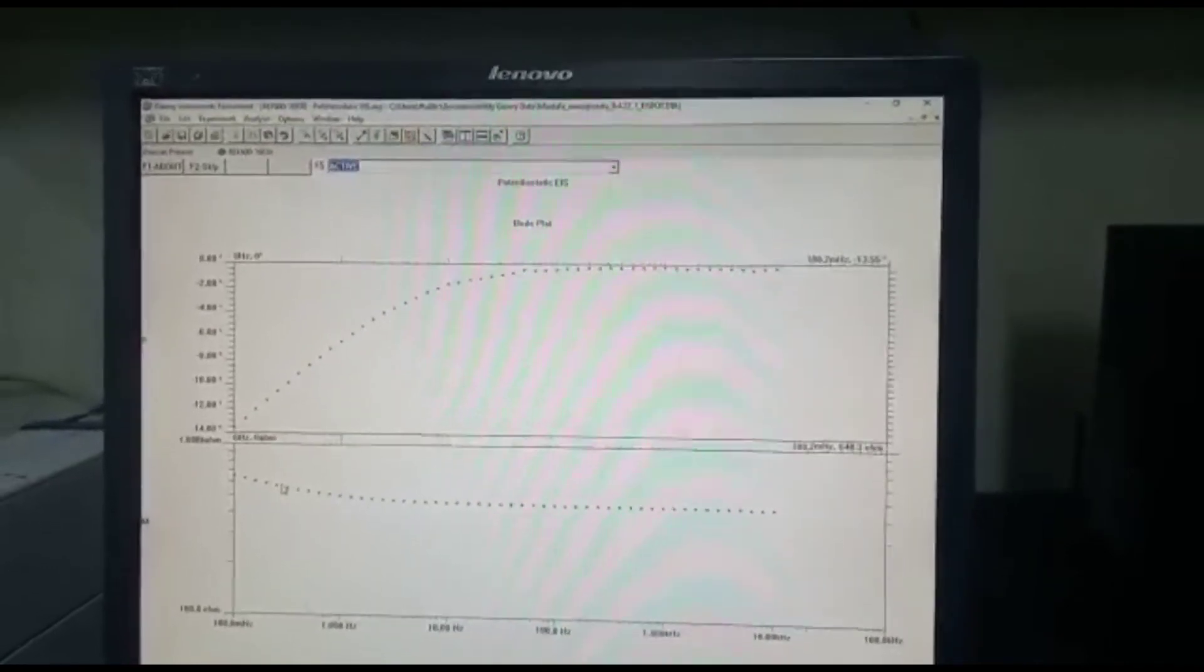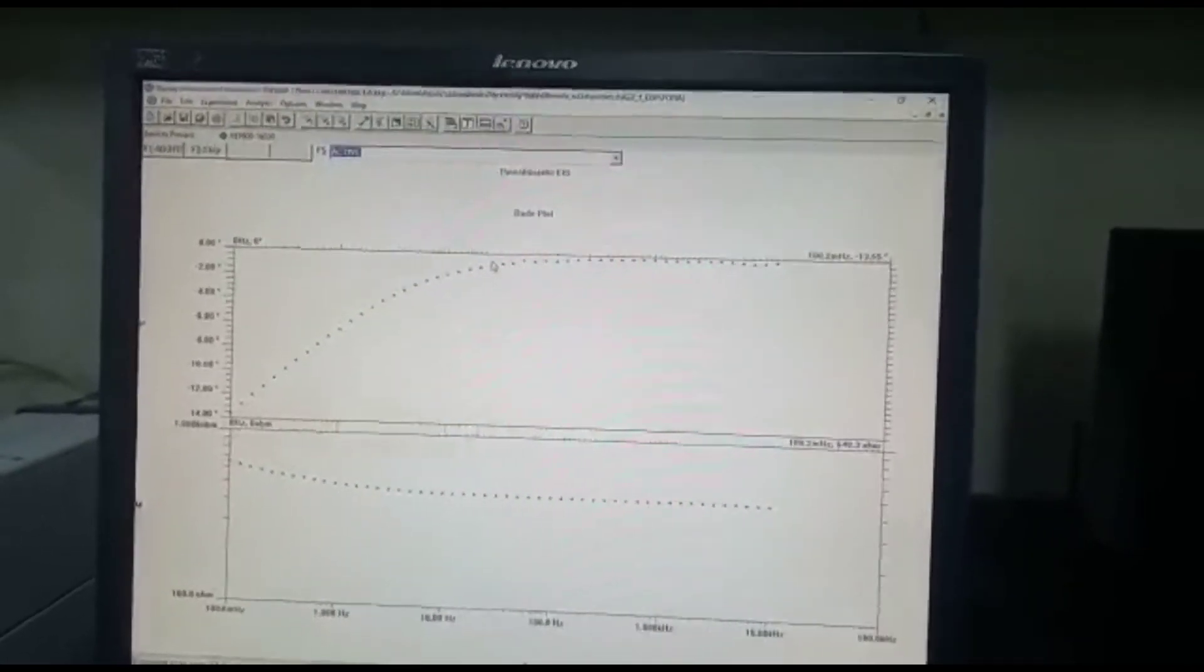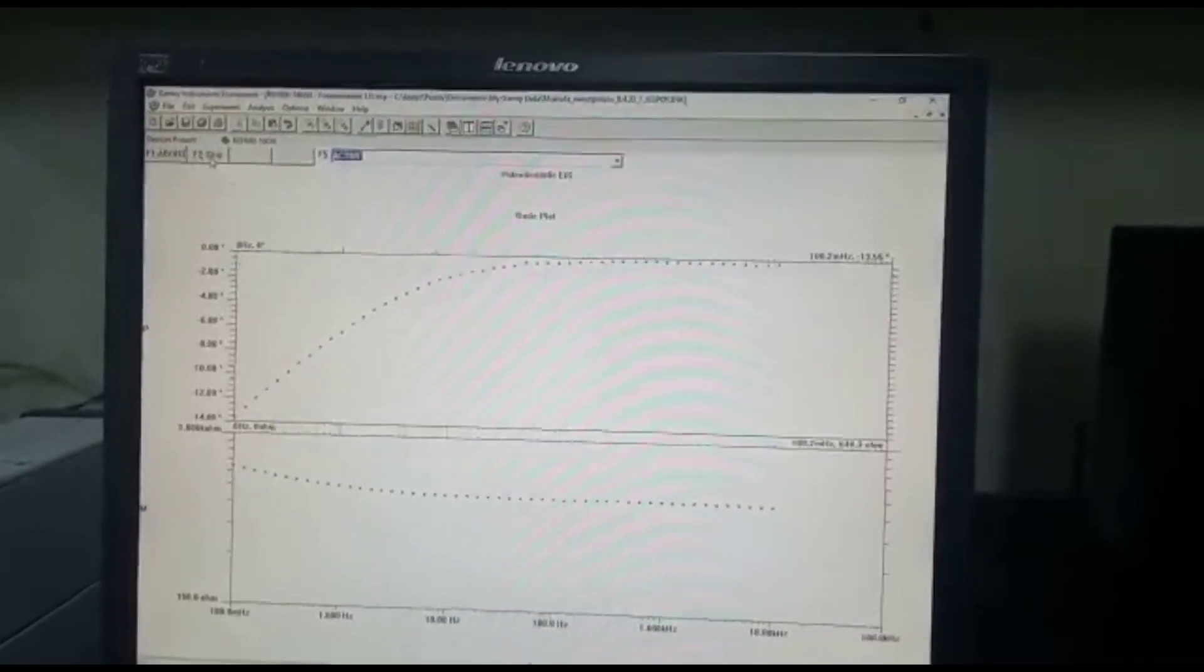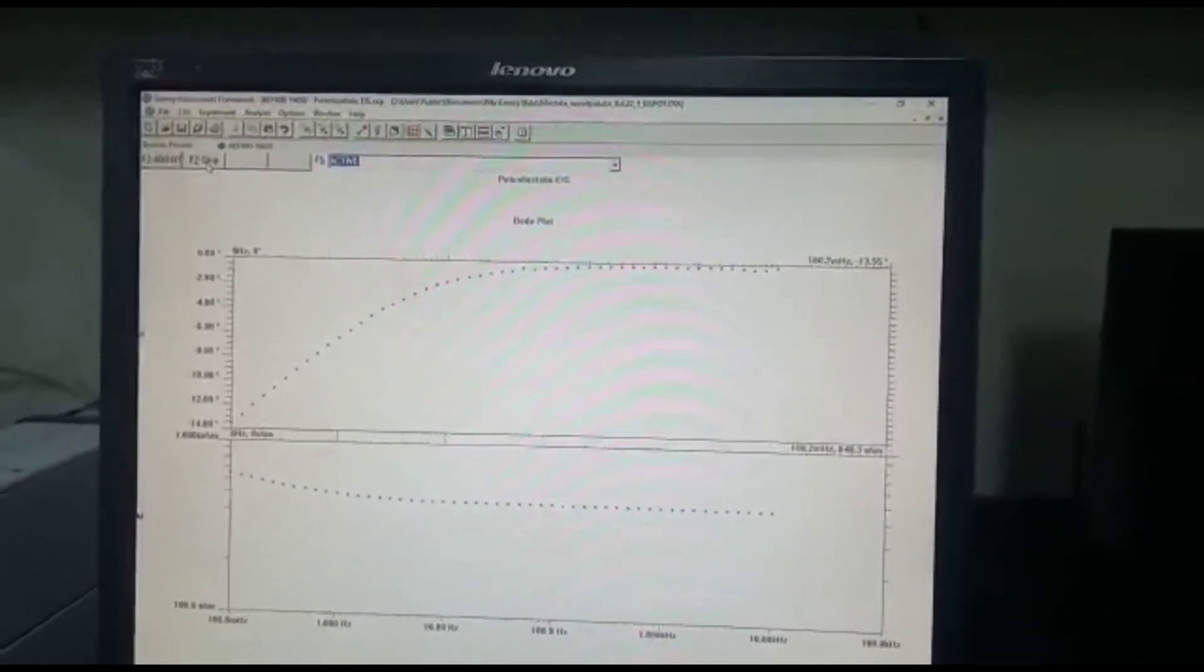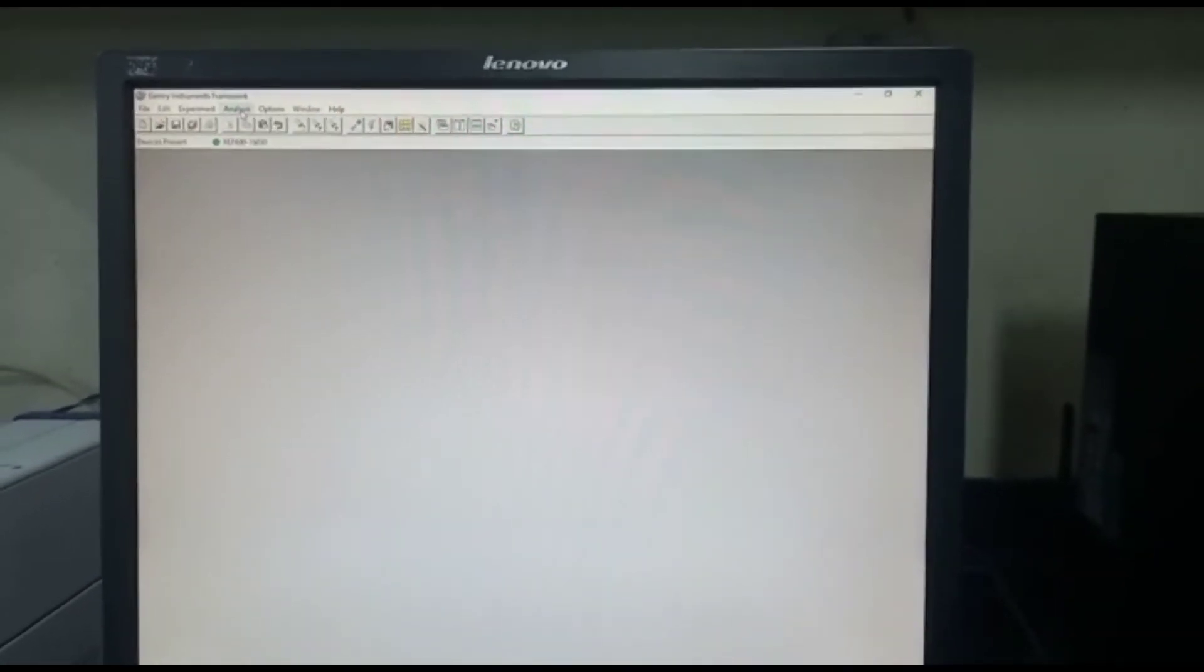We can see there's some resistance and also there's a capacitance that's forming from this microbial fuel cell. And then we just click F2 skip. You can go to analyze the sample.